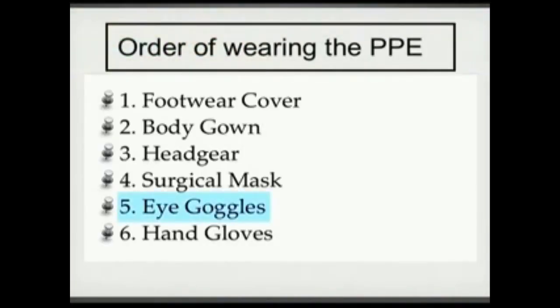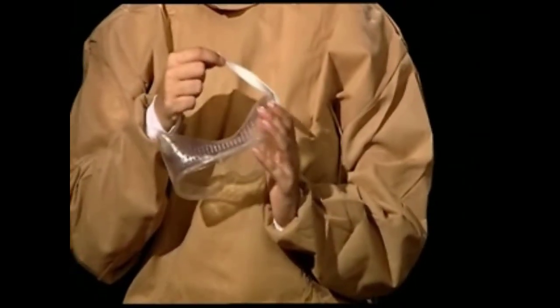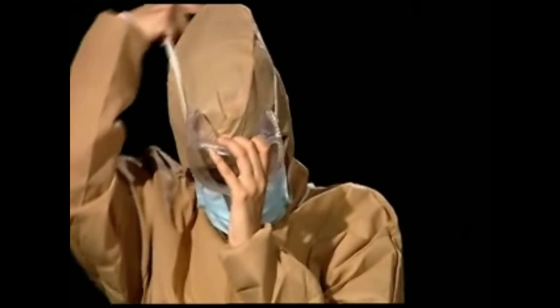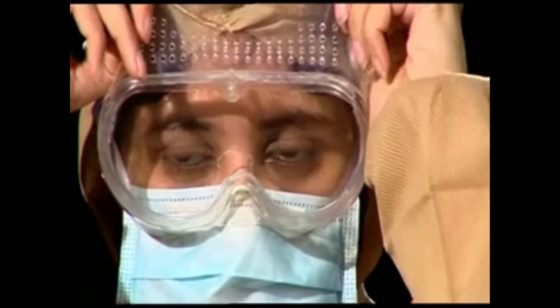Put on the goggles for eye protection. Fix the band of the eye goggles to ensure that the goggles are properly placed. The band should be placed over the headgear. This would also ensure that the headgear remains in place.